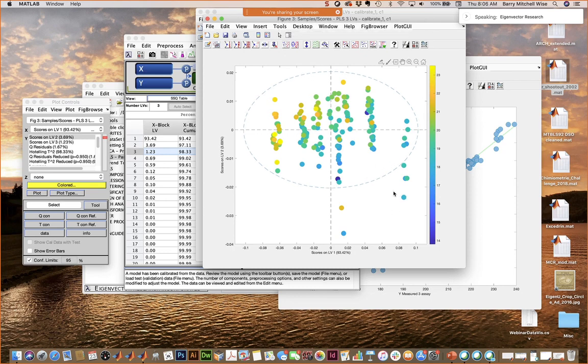So in general, there's apparently a relationship between hardness and assay value, but also with that weight parameter. So these are really good ways to find out some things that are going on in your data.